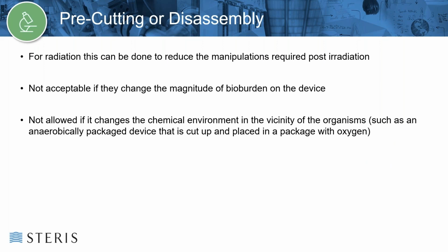For radiation, pre-cutting or disassembly of the device can be performed to reduce the manipulations required post-irradiation in our test of sterility. However, it's not acceptable if the preparation of that sample changes the magnitude of bioburden on the device, either reducing or increasing the bioburden, so that it is no longer representative of the product.